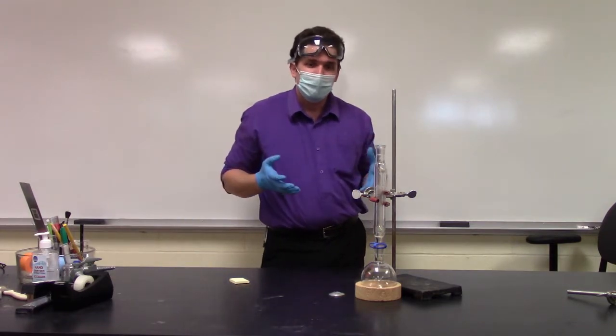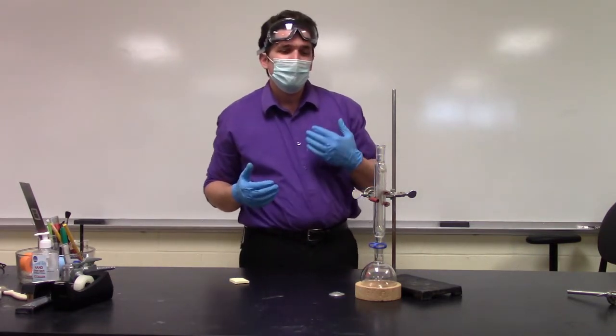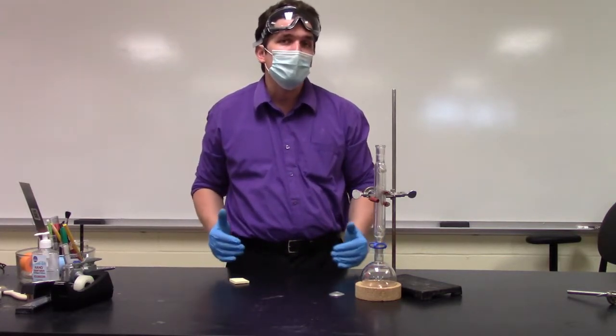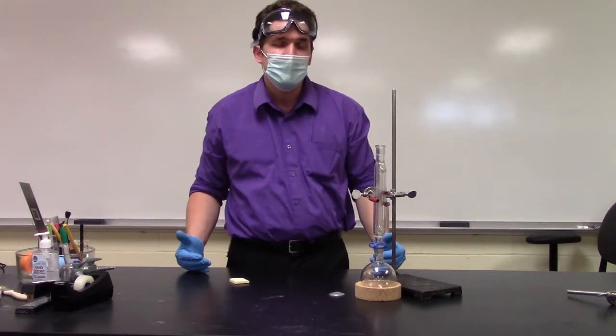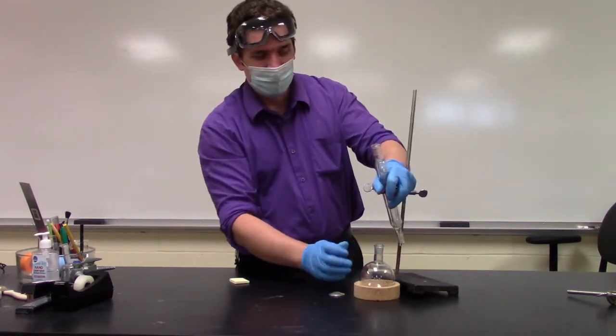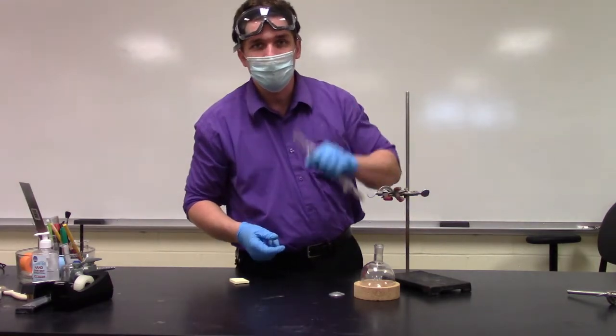But the big picture here is that with reflux, what you're trying to do is keep your more volatile compounds in the reaction mixture. Because again, there are sometimes where we have to run these reactions at high temperatures, and if we just ran them as an open flask like this, they would all just kind of boil out and be lost.